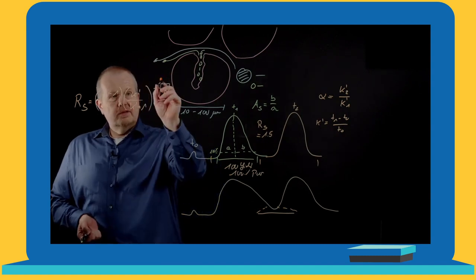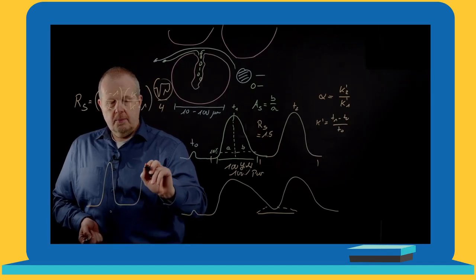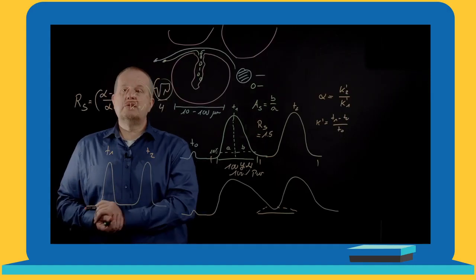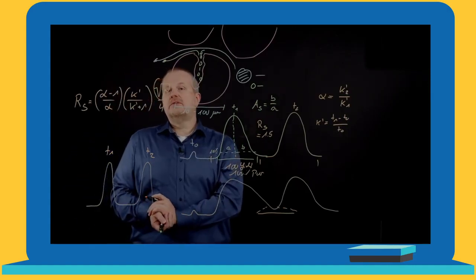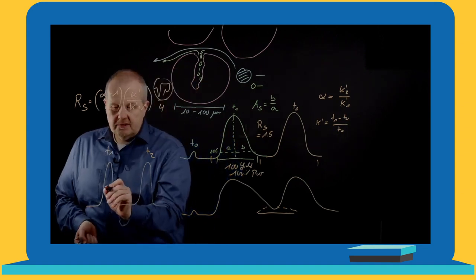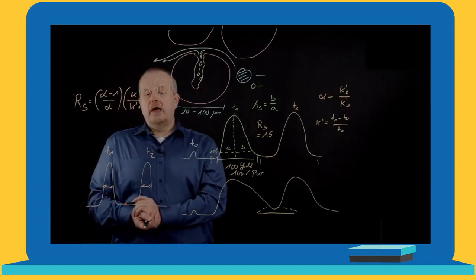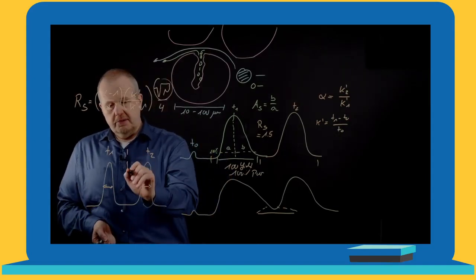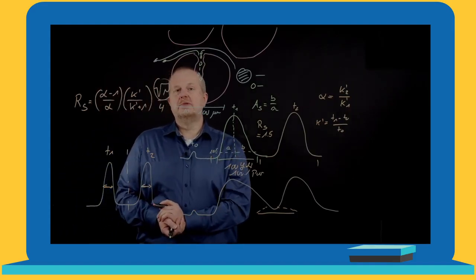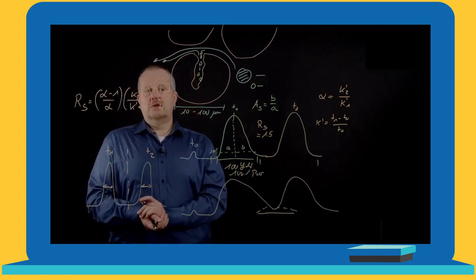If we optimize efficiency, it will end in two peaks which still have the same retention times. So our peaks appear at the same part in the chromatogram. The only thing which is different is that the peak width is narrower. And with that, we have again the possibility to separate both peaks in 100% yield and 100% purity. So how do we optimize efficiency?